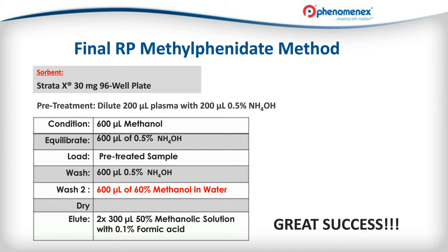So anyway, I'm really happy I got to share that with you because the dry down time took so long, and I just wanted to tell you all about how long that took. But what you got to do for reverse phase SPE is your own business.